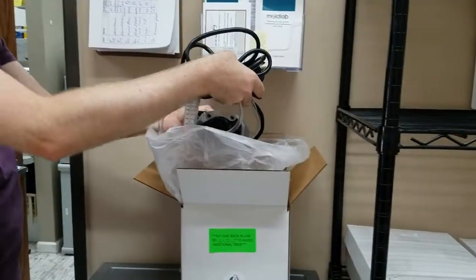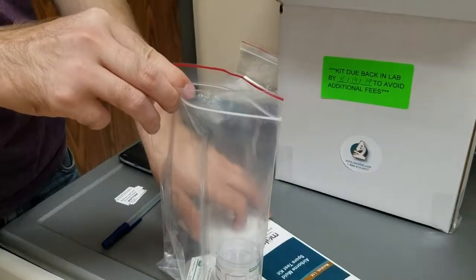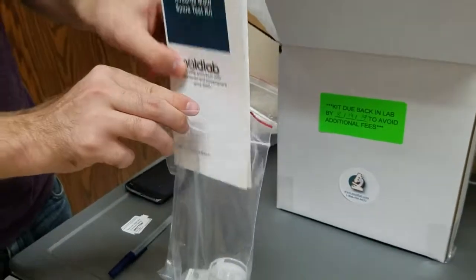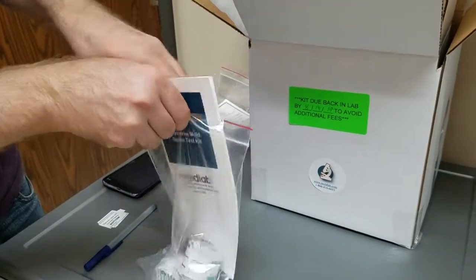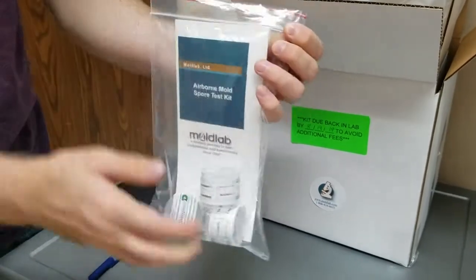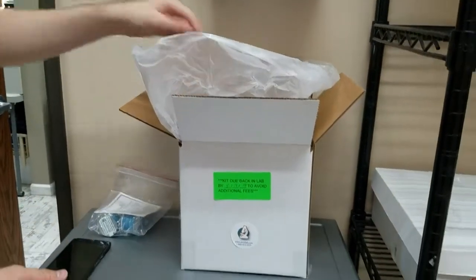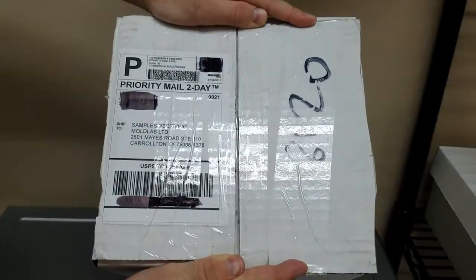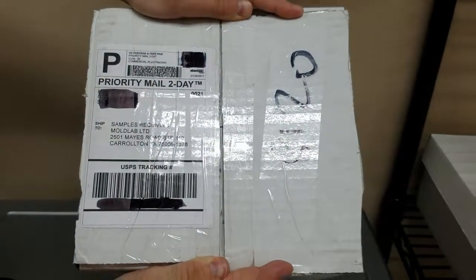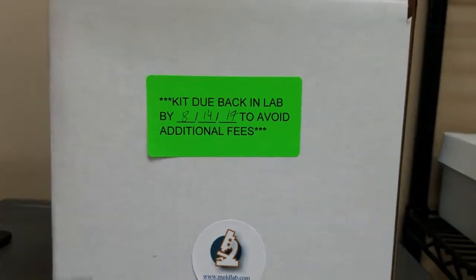When you are ready to mail the samples back to Mold Lab, place the pump back inside the box. Place your samples inside the bag along with your pamphlet and put them in the box. Be sure to place a return label on the box and return the kit to Mold Lab by the date specified on the green sticker.